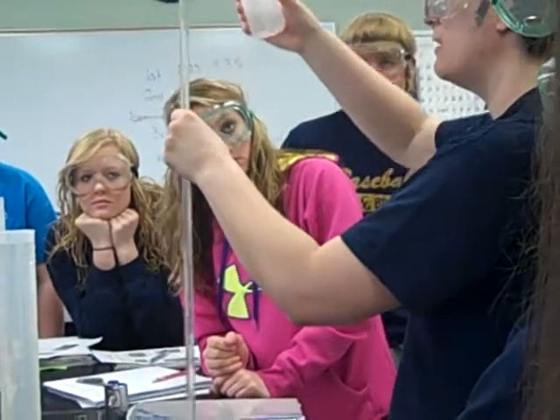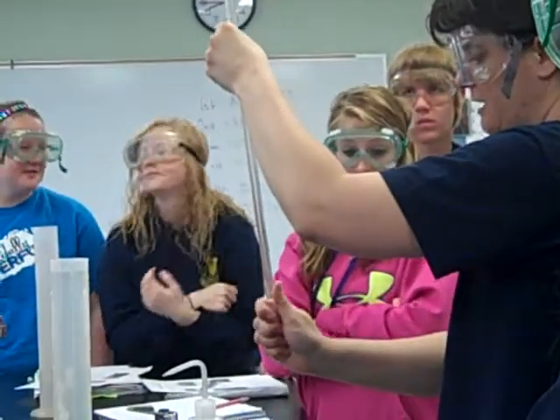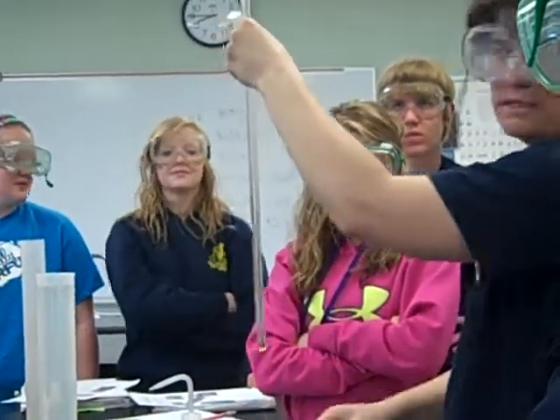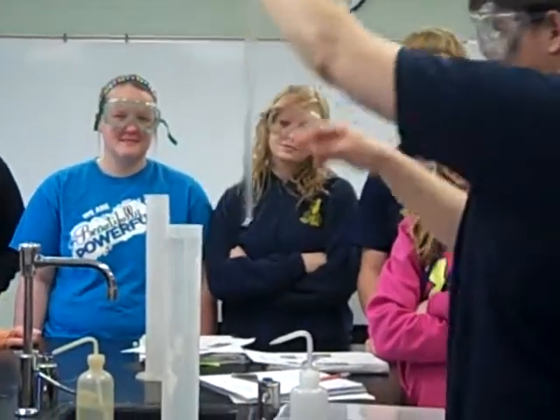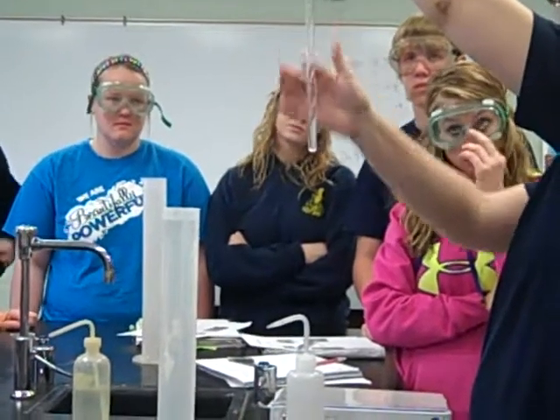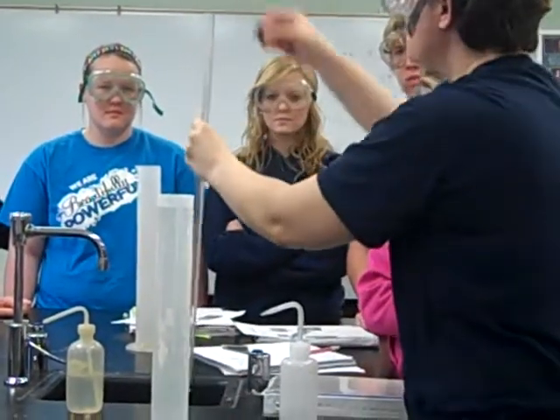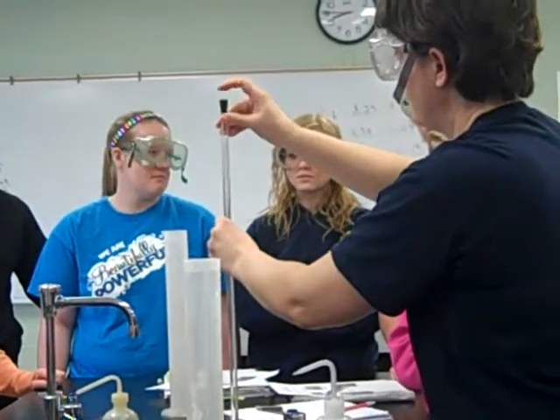Is it hot? It's not hot — well, it is a little warm. Anytime you add water to acid, it'll give off a little bit of heat. So we have water up here and hydrochloric acid on the bottom. The cage was almost too big, but we're going to add that in there.